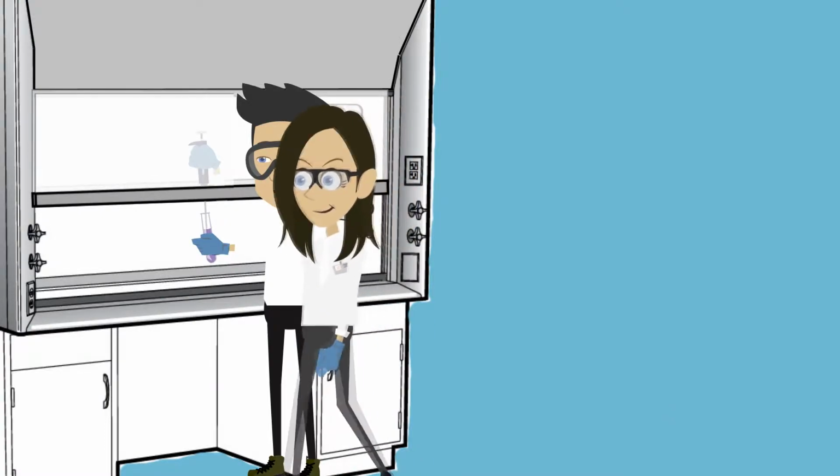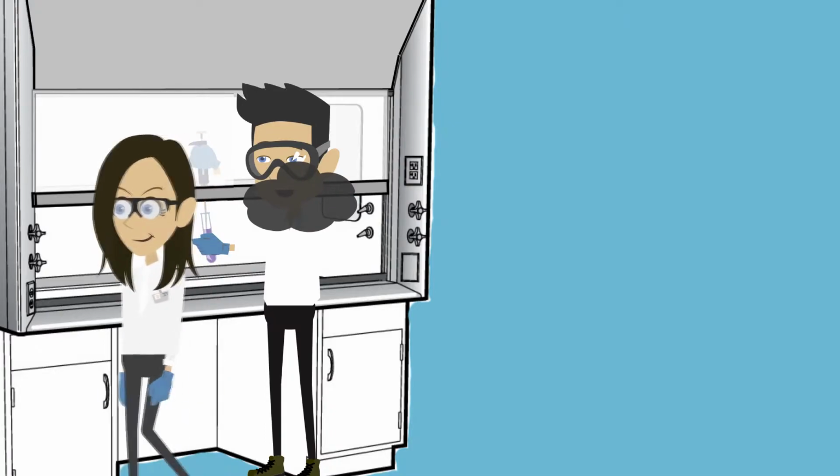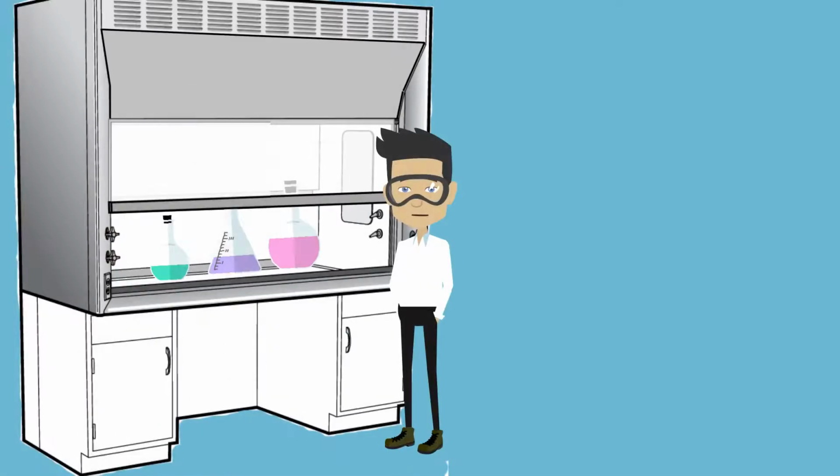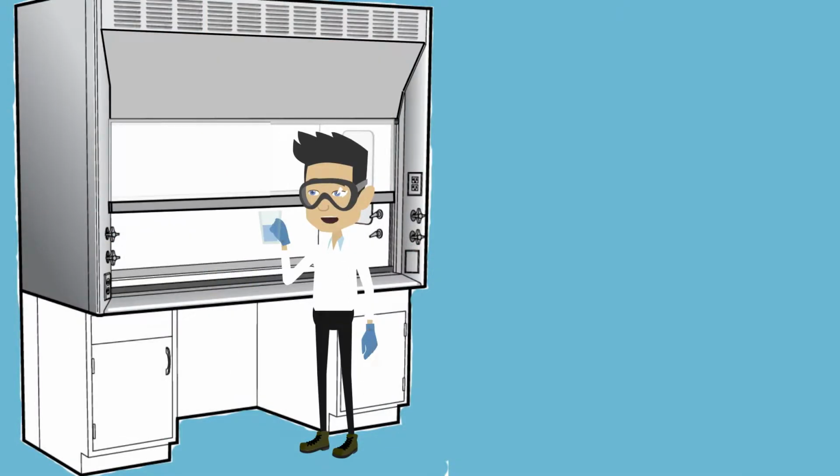People simply walking by the hood can cause air disturbances. That's why your hood should be located away from walkways. Do not evaporate or store chemical wastes inside the fume hood for long periods of time. A hood's exhaust does not usually have environmental controls on it, which is why you should not use it to dispose of hazardous chemicals by intentionally venting. Contaminated materials should be removed from the hood only after they've been decontaminated, or if placed in a closed outer container to avoid releasing contaminants into the lab.